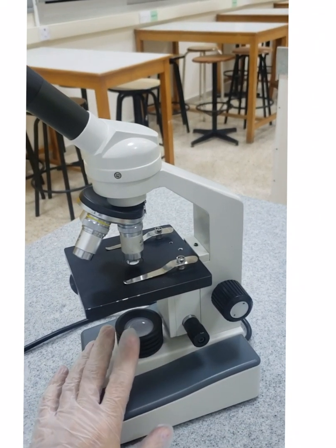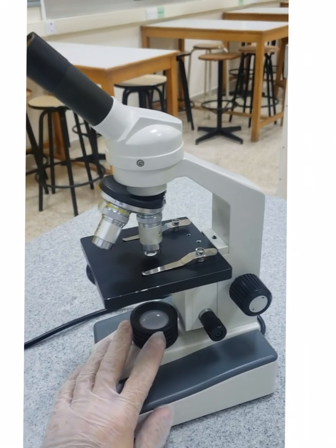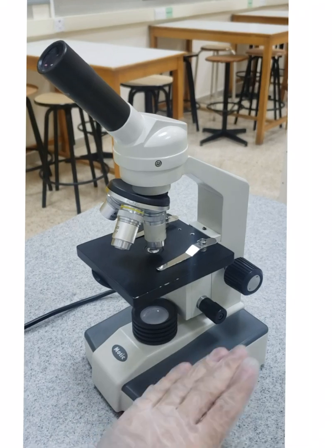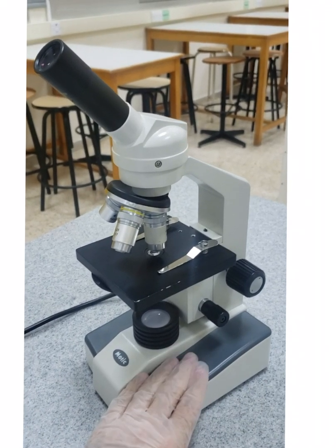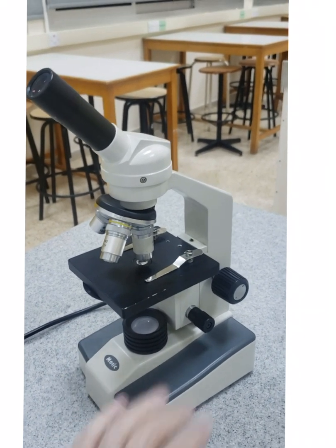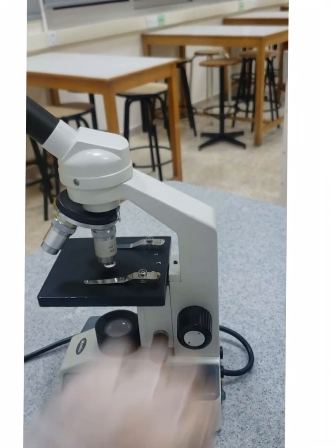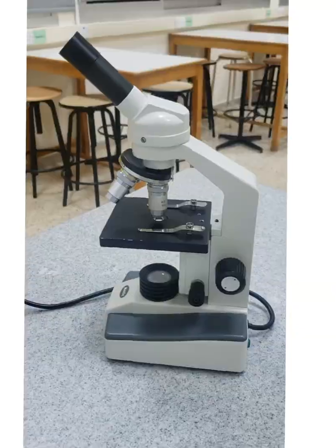The last part is the light source. This light source makes it easier to observe the slide. This is called the base of the microscope, and this is the arm of the microscope.